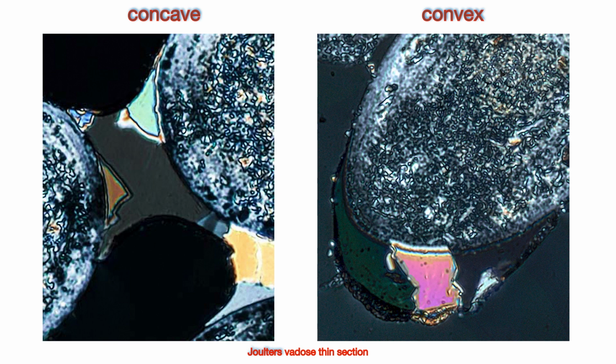The cross-polar images show how several differently oriented crystals are bound by smooth, concave, or convex surfaces. Intergranular pores in sediments in the vadose zone will be partly saturated for most of the time, and their air-water interfaces are meniscus surfaces. Interestingly, intergranular cement with concave surfaces are documented here from the Caribbean samples, but they are not present in the Mediterranean samples.